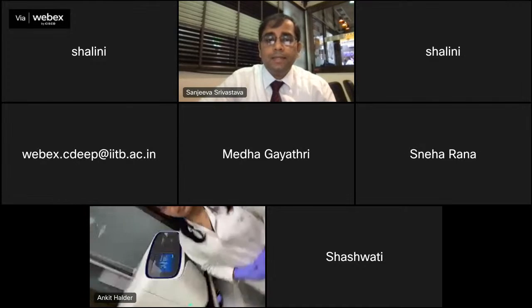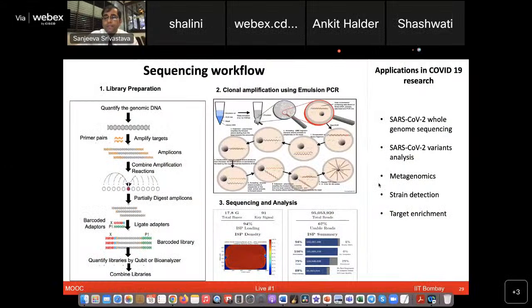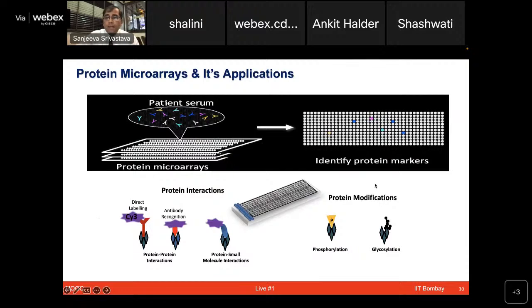Thank you, Ayushi. It, of course, takes a lot of time to do the experiment, but it was a good glimpse of the entire process. Moving on to the next technology, which is protein microarrays, where you have hundreds of thousands of proteins printed on a small miniaturized glass slide or nitrocellulose membrane for various applications. What I have shown here is a clinical application using patient serum samples to look for potential autoantibody biomarkers. One could use these kinds of high throughput technologies to look for protein interactors, even various types of post-translational modifications, and many applications are possible.